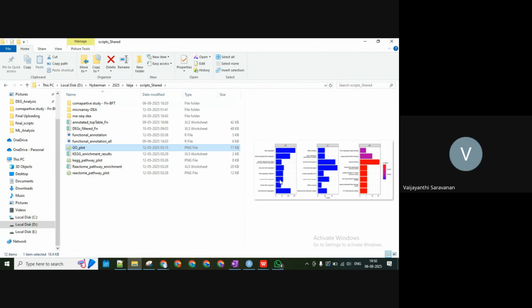This is for the specific RNA-seq and microarray data. Yes. But I don't want it for the microarray data or the RNA-seq data. I want it for the 24 DEGs. For that, we need to create the gene ontology.